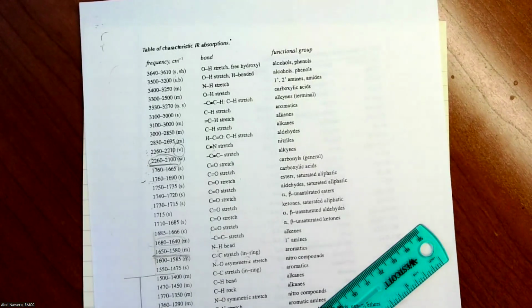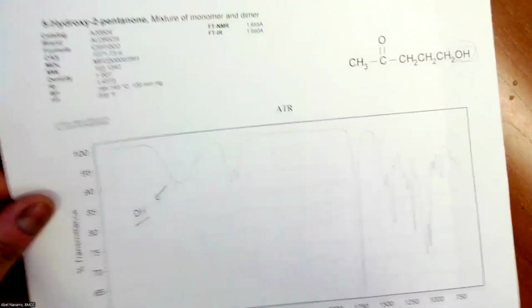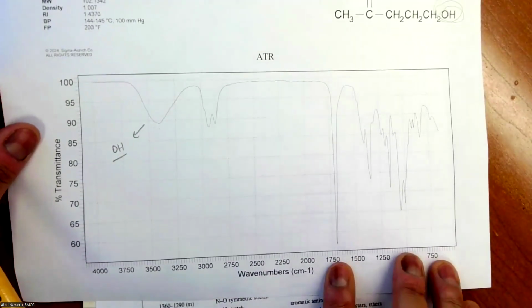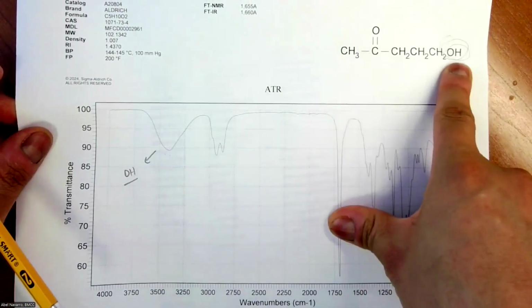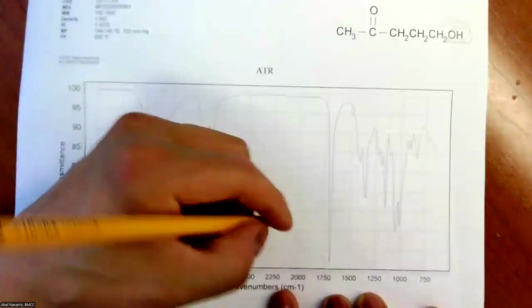Good. All right. Another example, a very interesting one. How do I know? Is it possible to have a C=O and an OH at the same time? Yes, and this is not a carboxylic acid. Look, you have a C=O and an OH. You have the C=O.